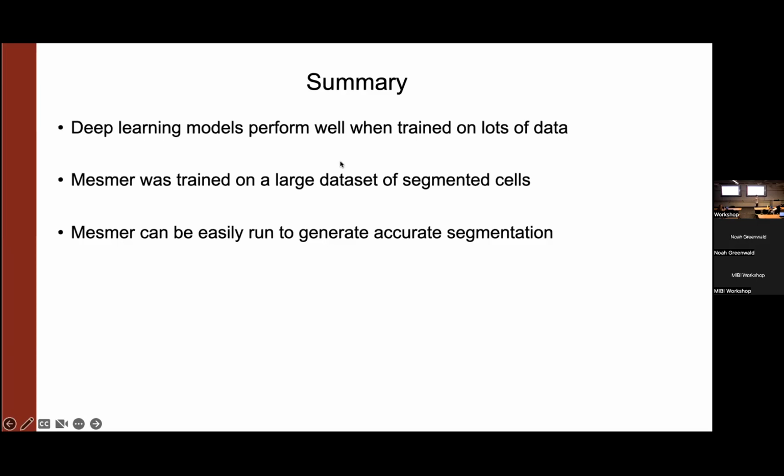You have these axonal projections that sometimes are in the 2D plane of the image, but sometimes they're going straight out of the image. There are these really, really long microglial processes. Especially if you're looking at disease, there's all kinds of other weird stuff in there. So in general, we said we don't know what to do with that, pass it to someone else, and just decided to be conservative. And for the brain, it will segment the nucleus, but nothing else.